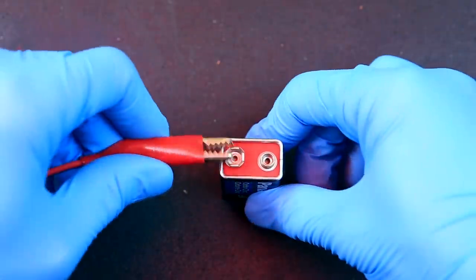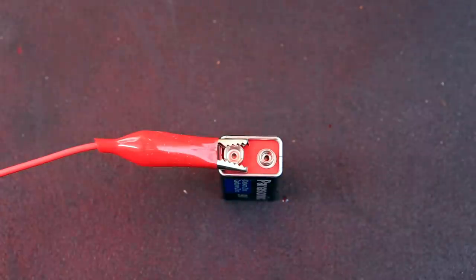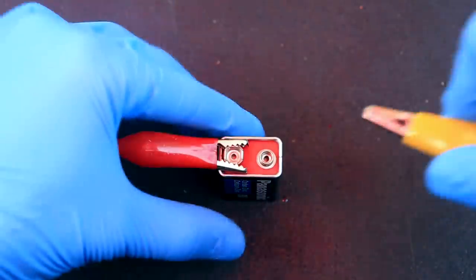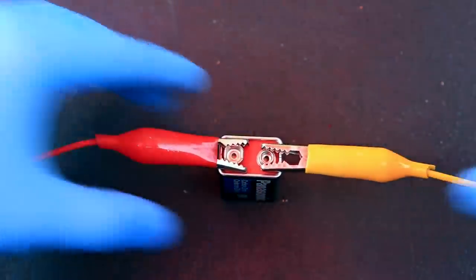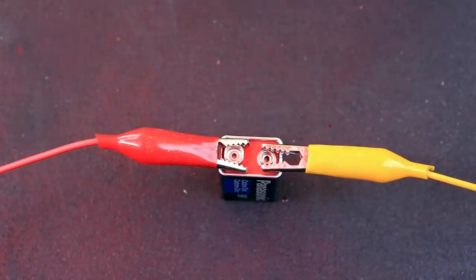Then to the power source, an alligator clip is attached to the positive and the negative terminals. The moment the circuit is completed by connecting the second alligator clip, the crystals should start to grow.